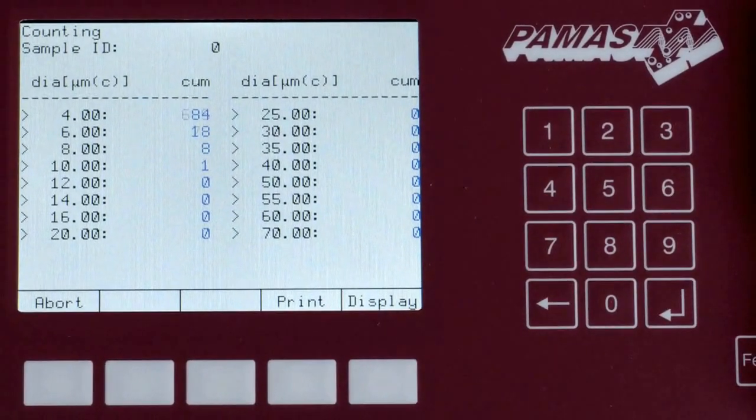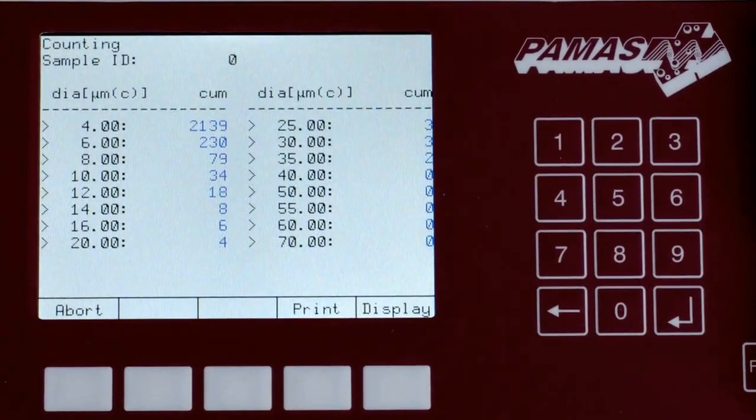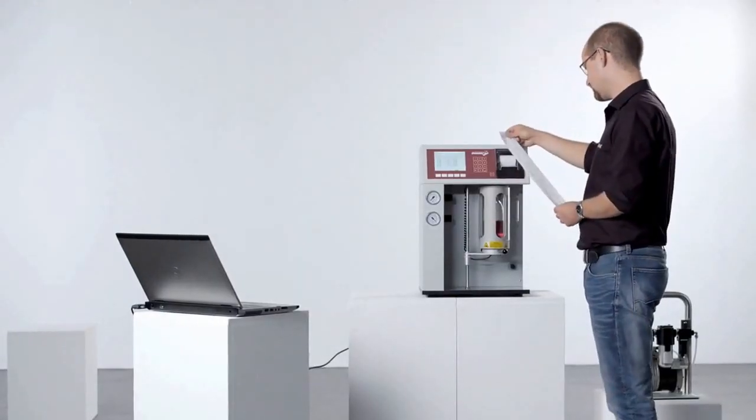The measuring results are transferred to the PC whilst also being displayed on the LCD screen. An integrated thermal printer provides instantaneous measuring results.